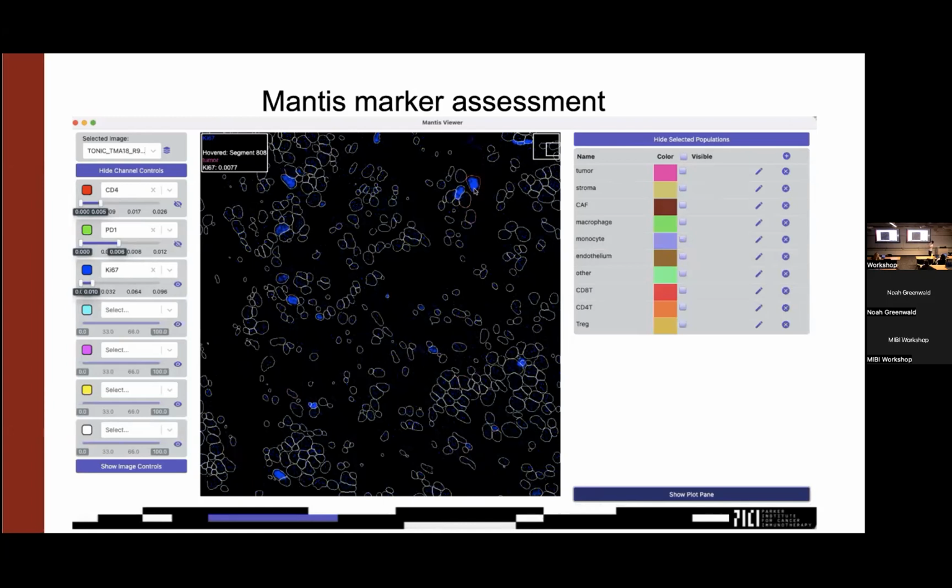But then you actually look at the image data, and you mouse over the examples that look obviously positive, look at the counts, look at the neighboring ones that are also positive, see what the range is, and then look at the ones that are obviously negative and see what the values are there. So far, I have found it very straightforward to set a threshold that separates the vast majority of the obvious positives and the vast majority of the obvious negatives. You can also change the scaling to look at some of the ones that initially appeared completely negative. You raise the threshold and see, okay, there's kind of a general background, but the same thing holds, that it is a pretty straightforward way to figure out what your markers are.